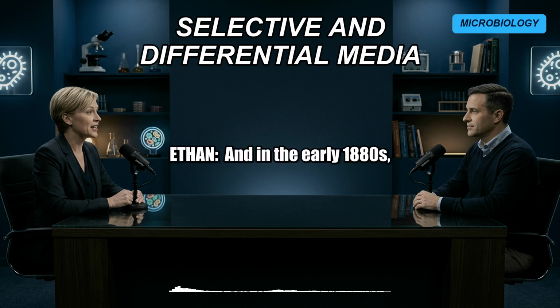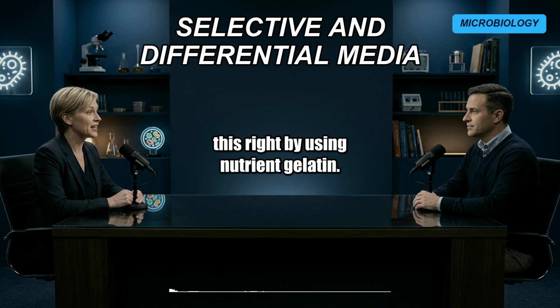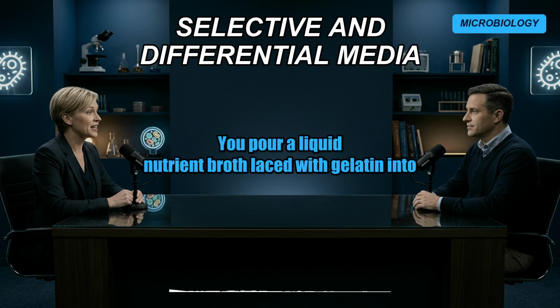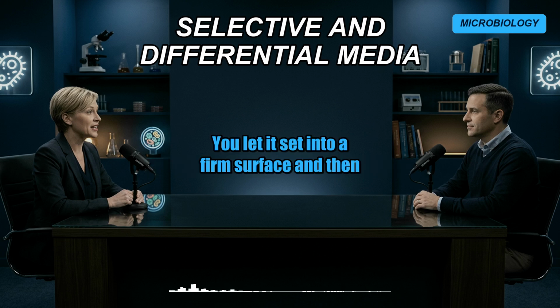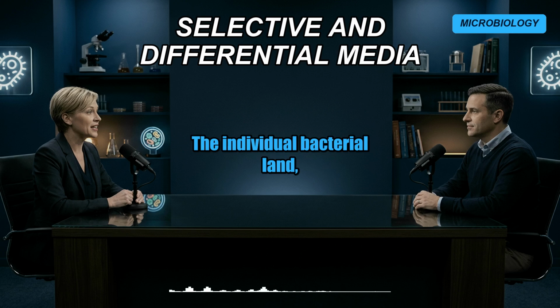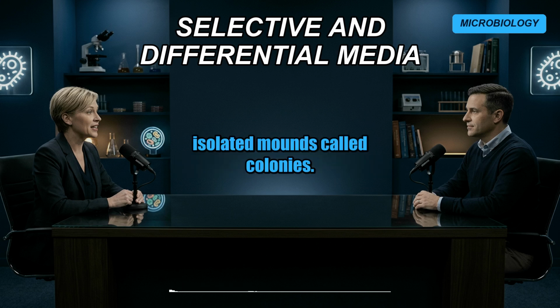And in the early 1880s, Robert Koch's famous microbiology lab was desperately trying to do this, right? By using nutrient gelatin. Yeah, the concept was simple enough. You pour a liquid nutrient broth laced with gelatin into a dish, you let it set into a firm surface, and then you just swipe your bacterial sample across the top. The individual bacteria land, they get stuck in place, and they multiply into visible, isolated mounds called colonies.